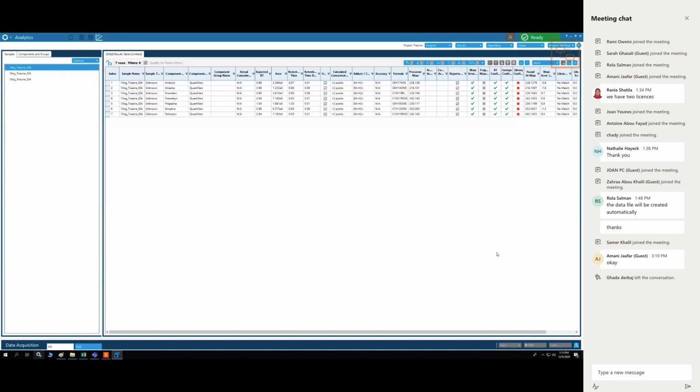I think that'll be good, and we pretty much cover all the basic processing by the end of the week. Oh, well, I should say the end of my week. You guys continue on Friday, right?